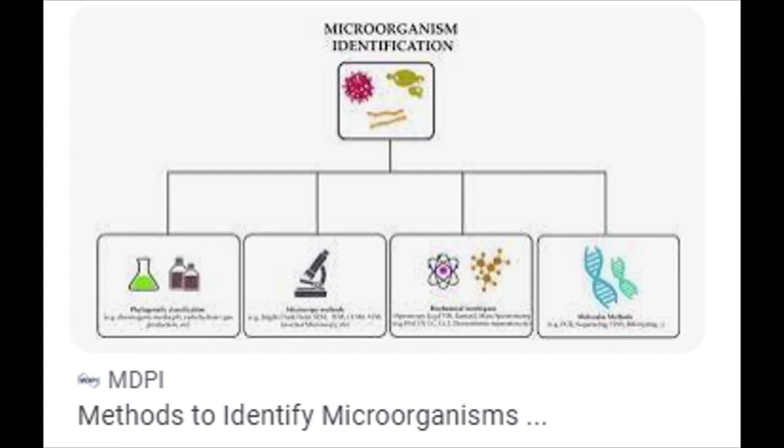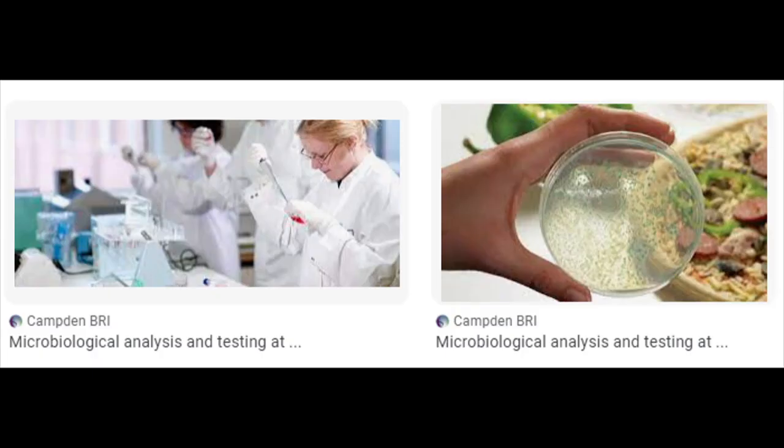So just like we have our own food inside a plate, microorganisms also have their food in a plate. This is a bottle, this is not a plate. So the plate of the microorganism has a cover. We call the cover the lid. Then the plate is flat. It's not long like this, it's flat.